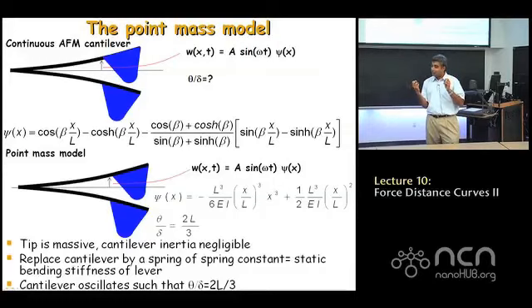But if you think about it, the cantilever spring constant calculation assumes that it bends as a cubic polynomial when you have a static force applied to it. And when that is true, we derive this expression, cubic polynomial, when you have a point force applied at the end, you get the relationship that theta and delta, theta is the bending angle that you actually measure, delta is the actual deflection, are related by 2/3 of the cantilever length, okay? However, in reality, when you drive the first eigenmode of the cantilever at resonance, the shape psi of x in which it vibrates is no longer a cubic polynomial. It is a more complicated expression.